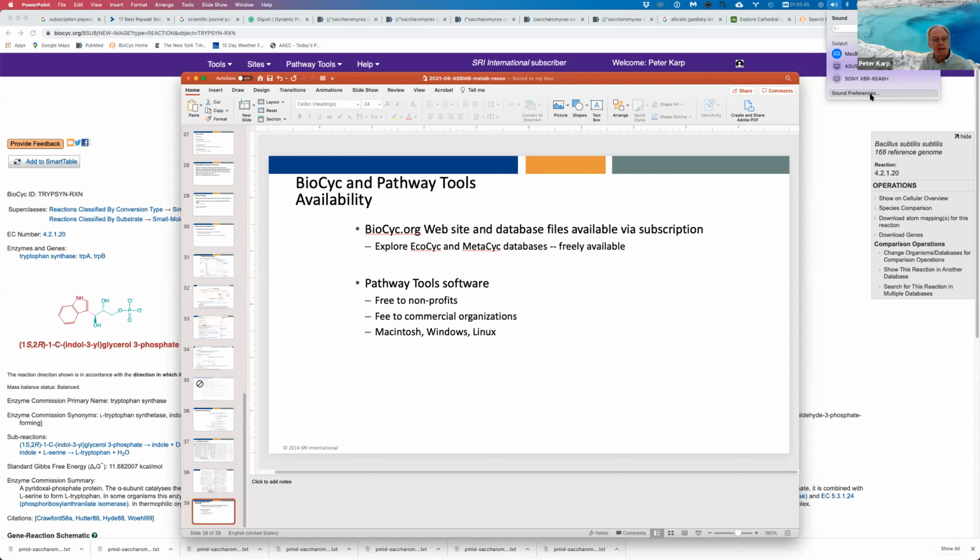Yeah, I guess I forgot to mention the formats that we accept. We accept GFF3 format as an annotation format, and GenBank files, in particular the GBFF file format, which is a variant of GenBank format. The nice thing about GBFF format is you can pack multiple replicons and contigs into one file. So it just makes it very easy to input that into Pathway Tools, so we highly recommend GBFF format.